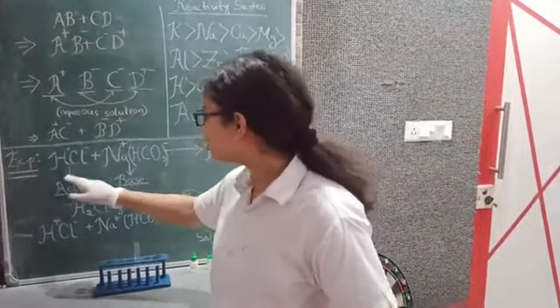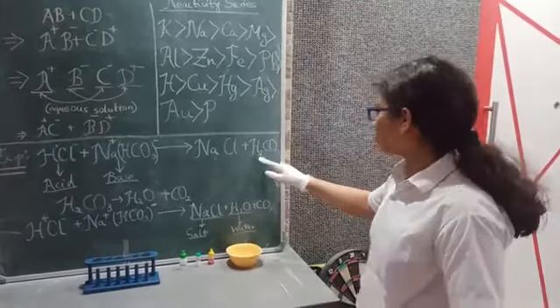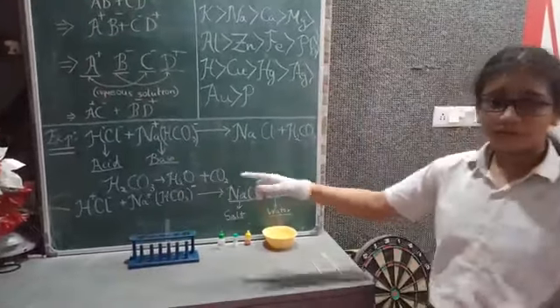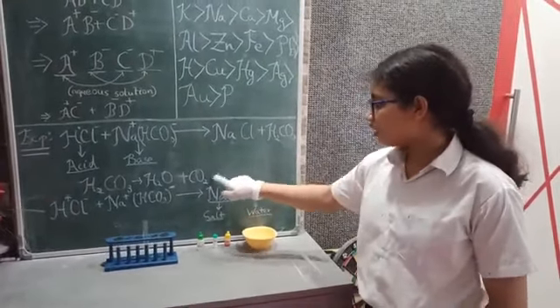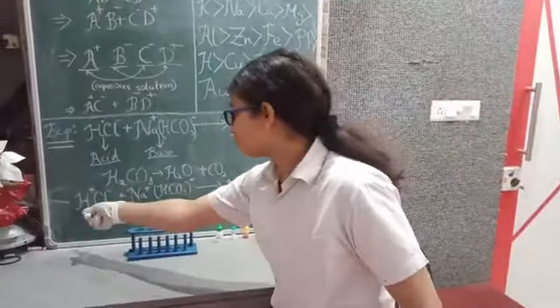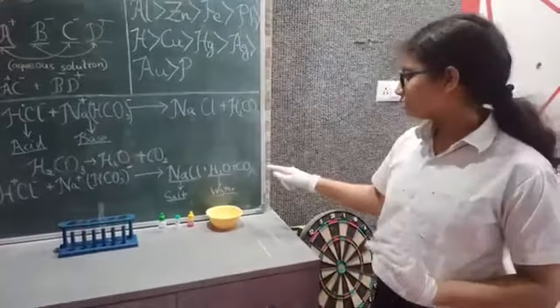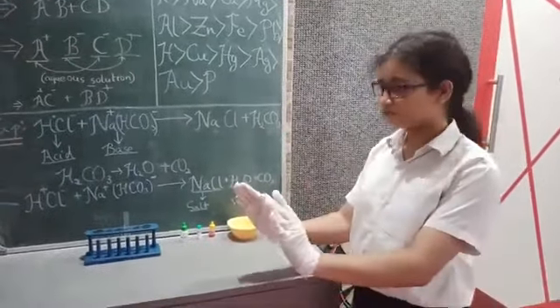And H on the other hand will react with bicarbonate ion and will create H2CO3. And internally H2CO3 will break into two compounds, H2O and CO2, or water and carbon dioxide. So finally the equation formed is HCl plus NaHCO3 is equal to NaCl plus H2O plus CO2. So right now I hope you have understood, because I am now doing the practical experiment.